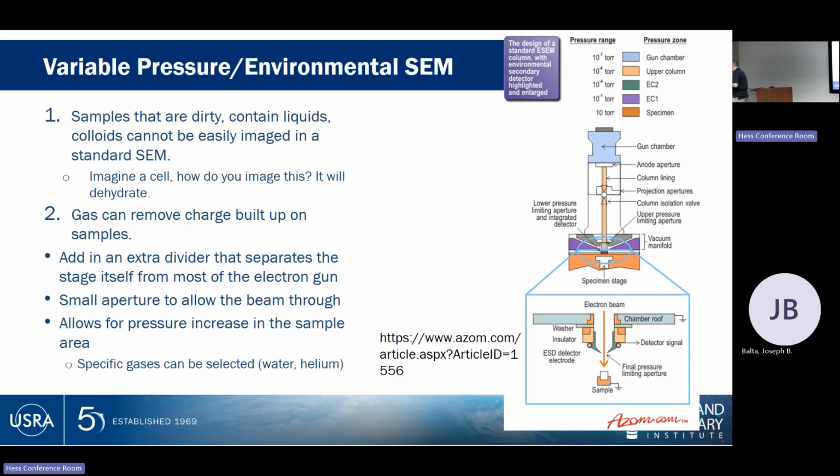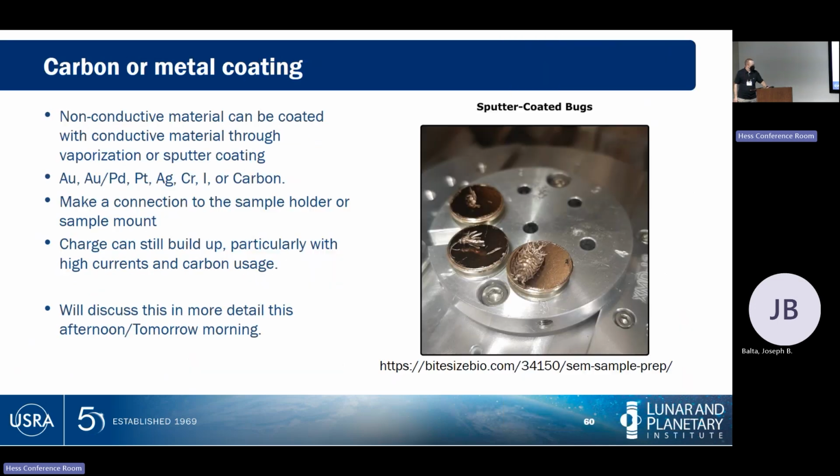Well, I was going to say, the whole thing needs to be conductive, and so you really need to have a conductive coat on the middle of the thing, not just a piece of carbon tape on the side. We use the carbon tape or a piece of aluminum tape or copper tape in addition to the carbon coat to make sure we have a contact between the top of the sample with the carbon coat on it and then the middle of the holder itself. And also to just hold the insect in place.